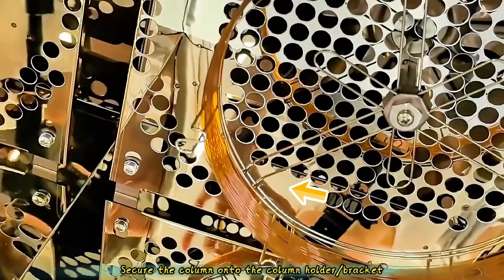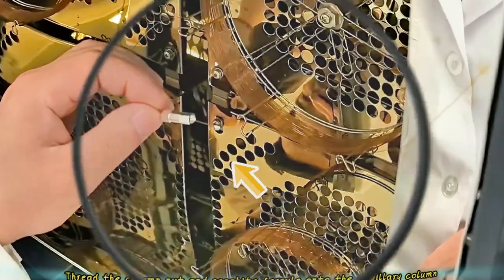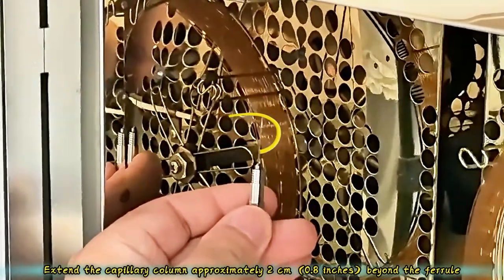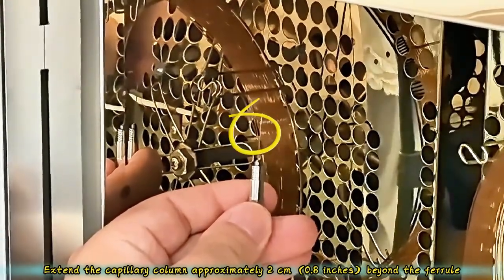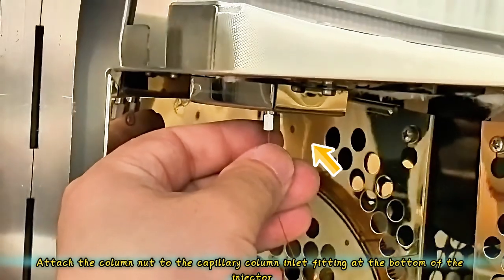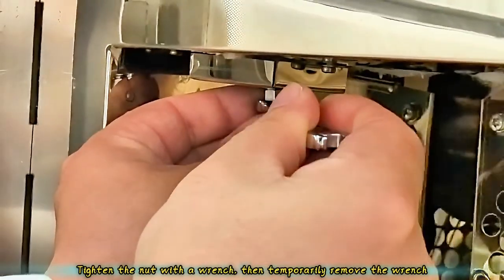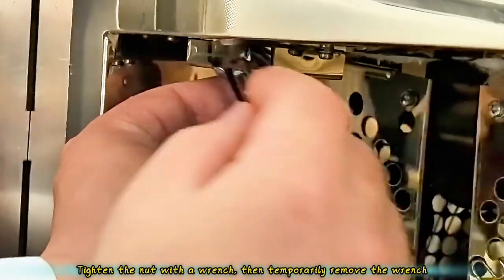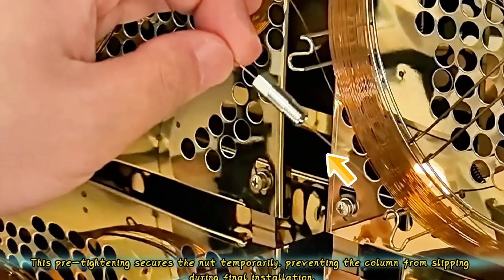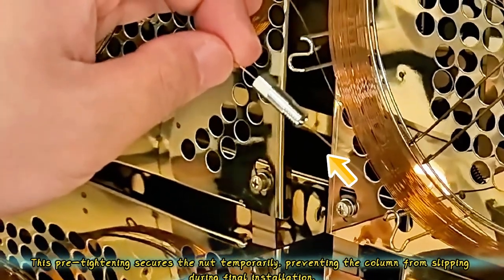Secure the column onto the column holder bracket. Thread the column nut and graphite ferrule onto the capillary column. Extend the capillary column approximately 2 cm (0.8 inches) beyond the ferrule. Attach the column nut to the capillary column inlet fitting at the bottom of the injector. Tighten the nut with a wrench, then temporarily remove the wrench. This pre-tightening secures the nut temporarily, preventing the column from slipping during final installation.